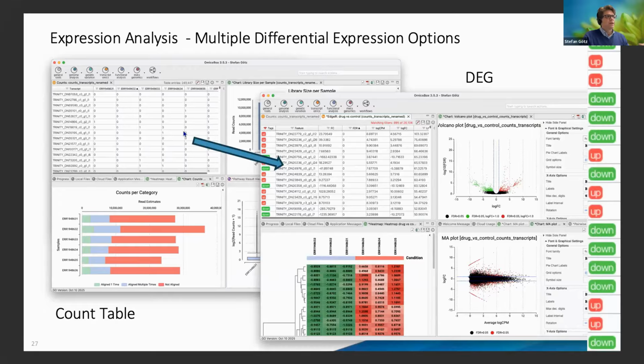And this gets converted with a differential gene expression data analysis into a table where we have, again, the same IDs, the same sequence names, but then with the statistical values, which for edgeR, for example, is the FDR, fold change, log fold change, and so on.